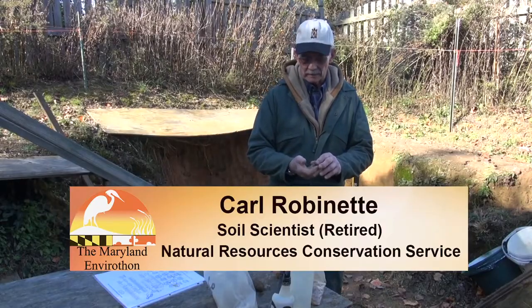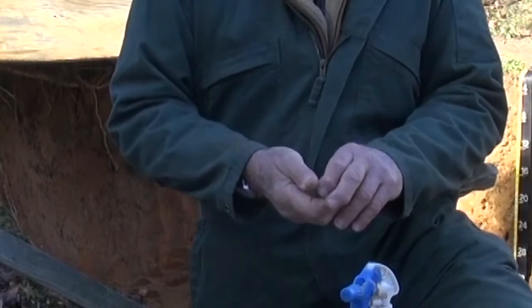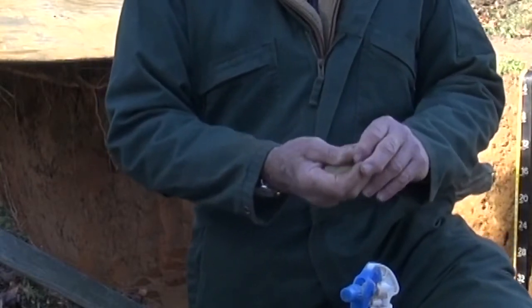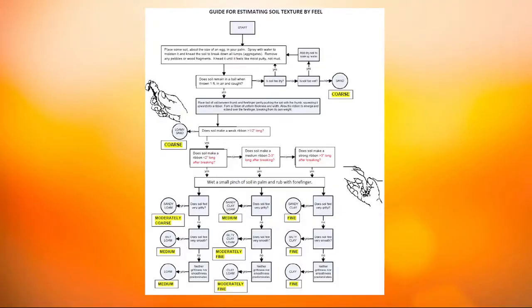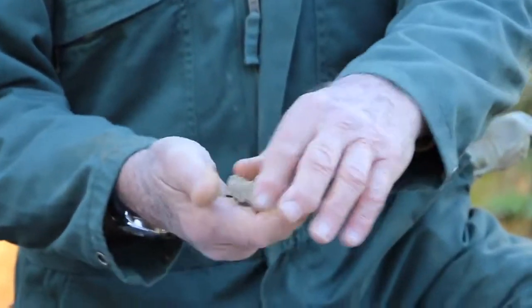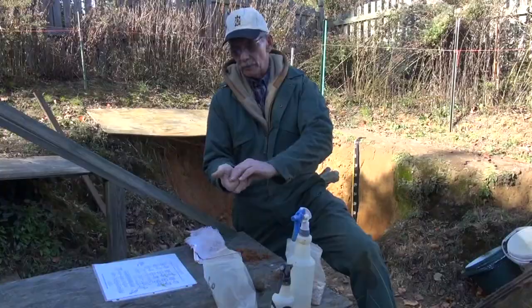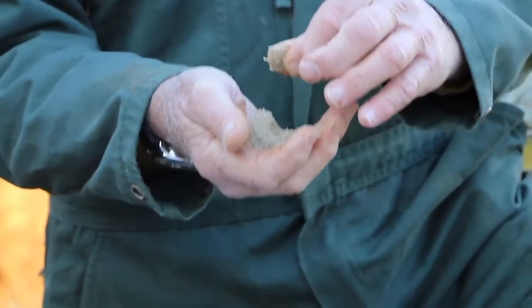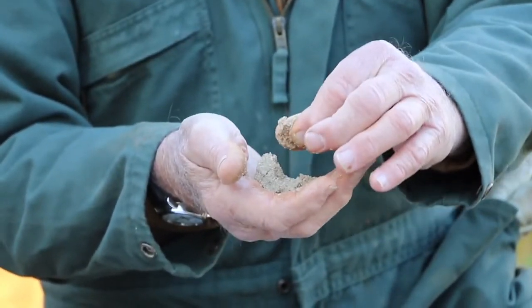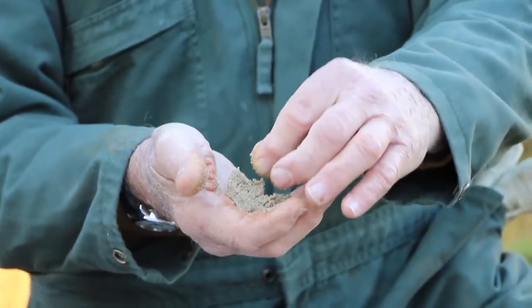Now we want to demonstrate determining soil texture by the feel method. It's important as we're going through this that you have the guide for estimating soil texture by feel. We start with a sample about a handful or several tablespoons full. We work the sample — the first thing you can do is rub it between your fingers to see how gritty it feels. In this case this feels very, very gritty.